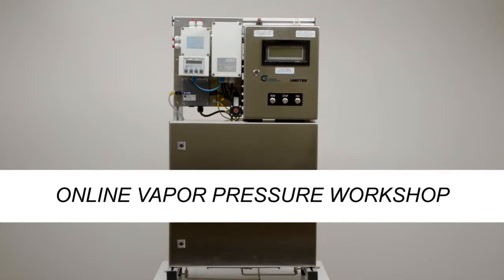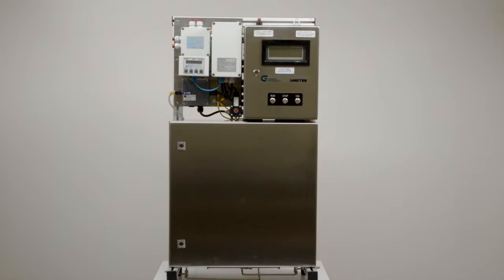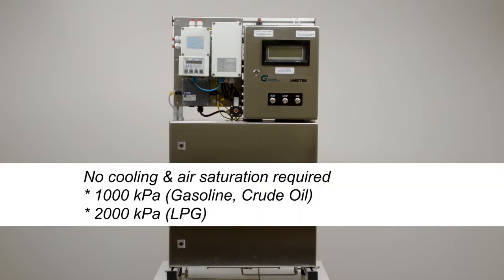Online Vapor Pressure Workshop. The MINIVAP Online Vapor Pressure Process Analyzer does not require sample cooling and air saturation. Maximum pressure is 1,000 kPa for gasoline and crude oil measurements and 2,000 kPa for LPG measurements.